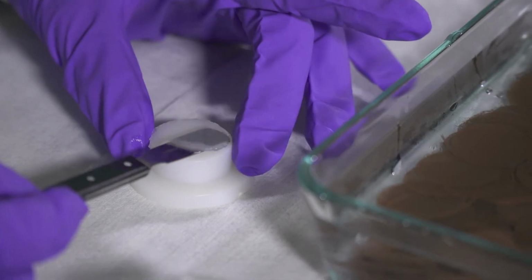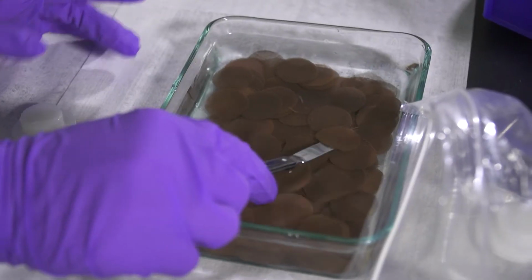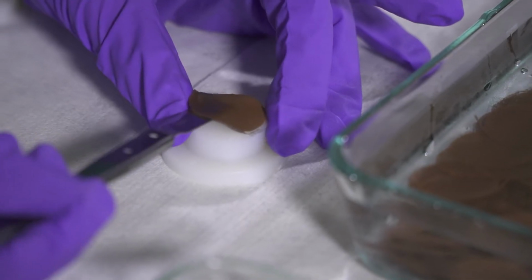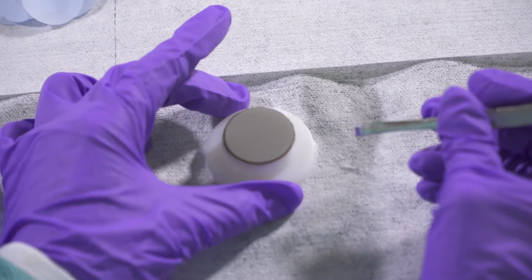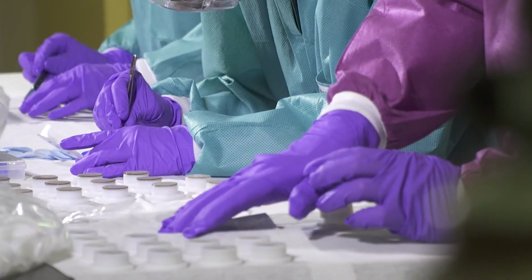And what we were trying to do was develop a sampler that would measure the different species of mercury, because for mercury, the species that exists in either waste or the environment is a key to how it behaves, how you can remove it, or its toxicity, how much builds up in fish.